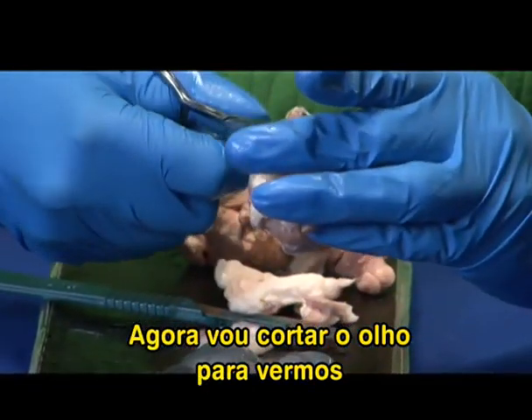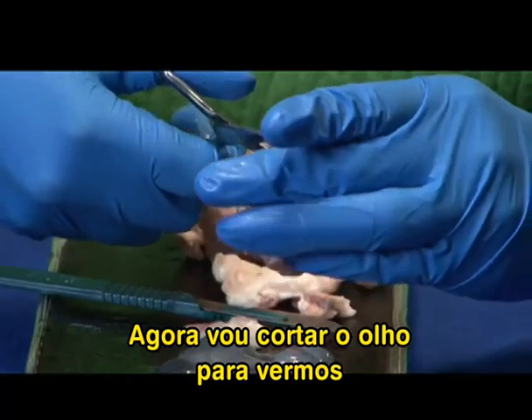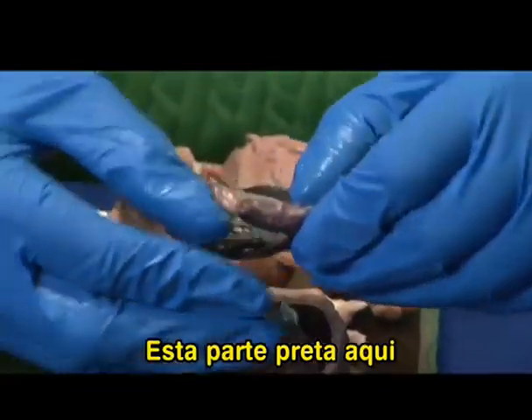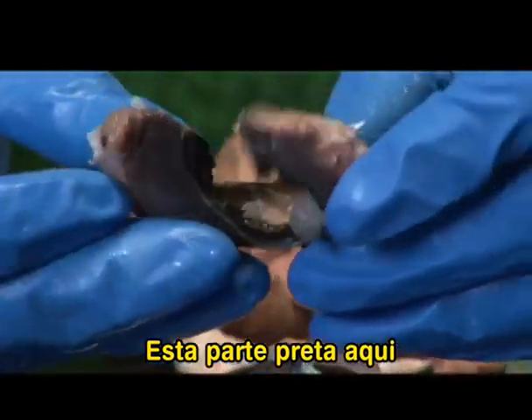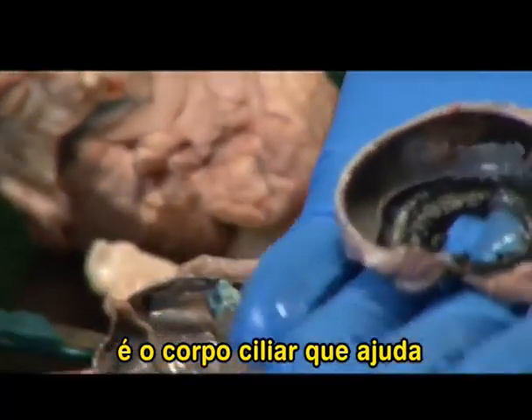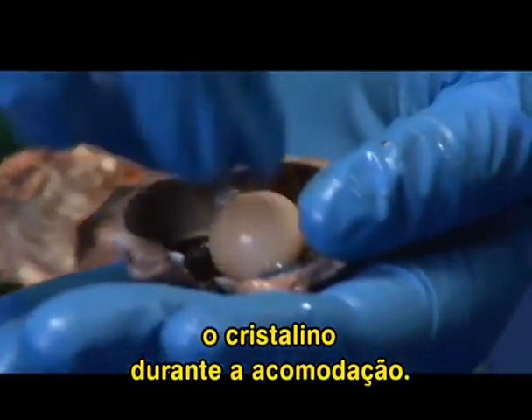Now I'm going to cut into the eye so we can see that ciliary body that's surrounding the lens. So this black portion here is the ciliary body that helps the lens during accommodation.